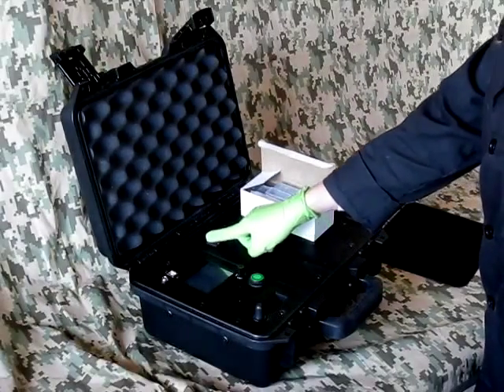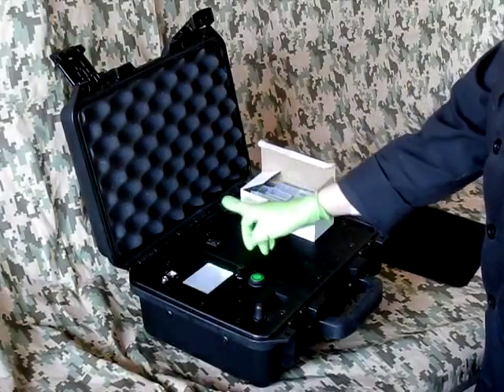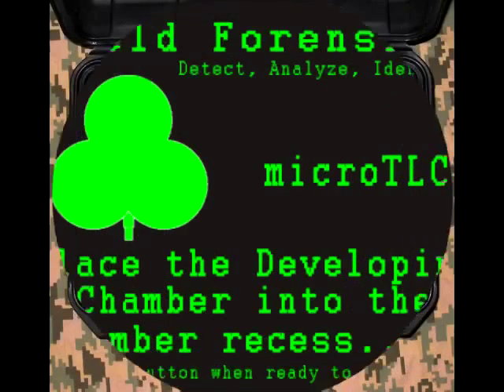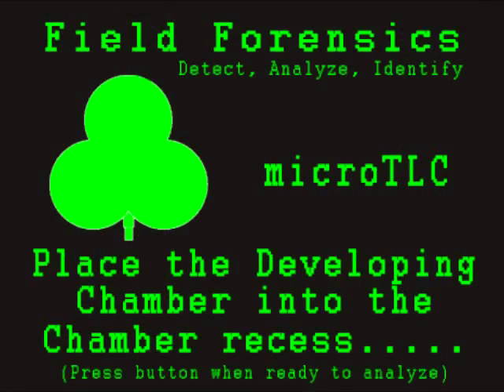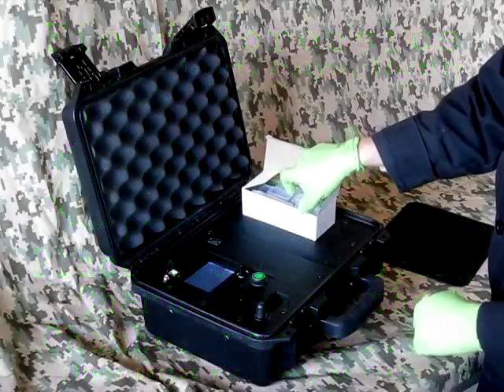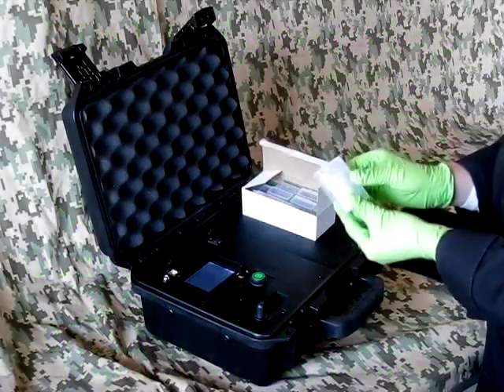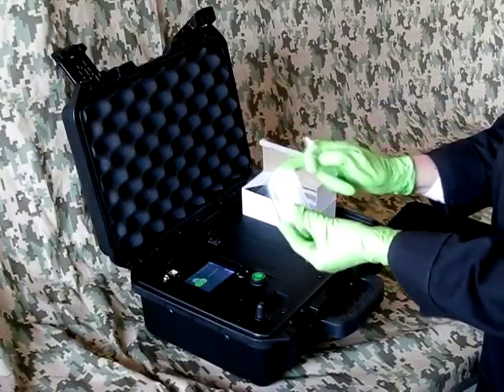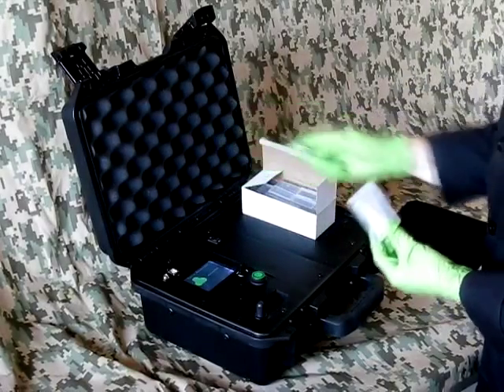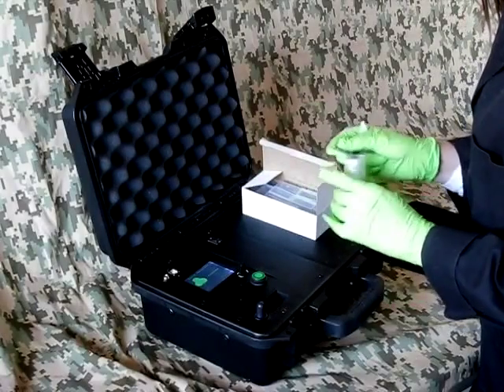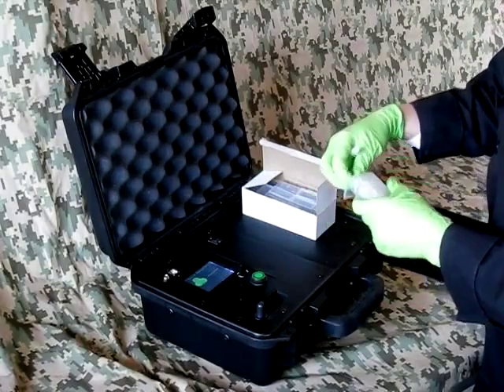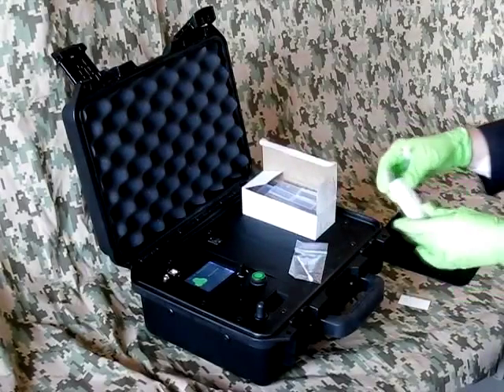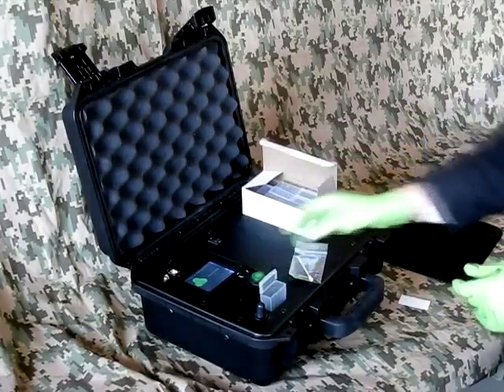For micro TLC testing for explosives, turn on the micro TLC. The screen will give you step-by-step instructions. First, remove the consumables from the box — the developing chamber and the mobile phase. The consumables come inside the developing chamber. Place the developing chamber in the slot and press the button.